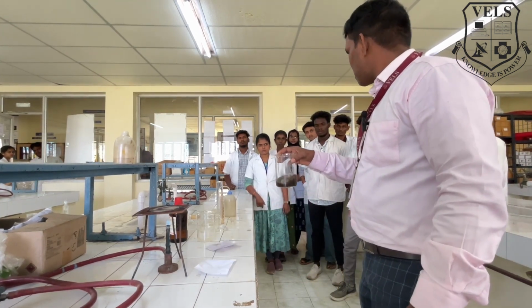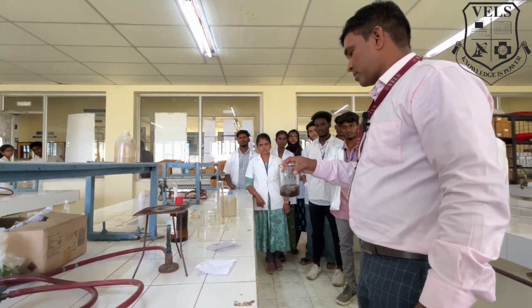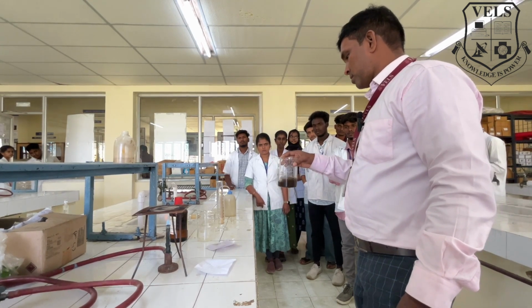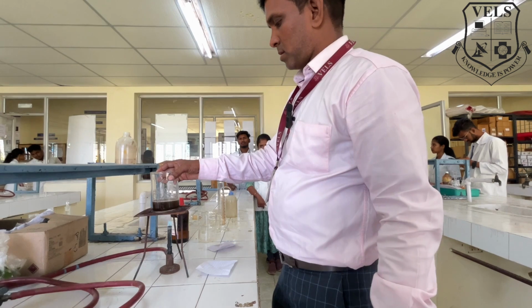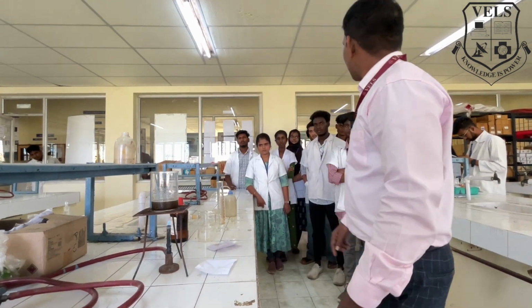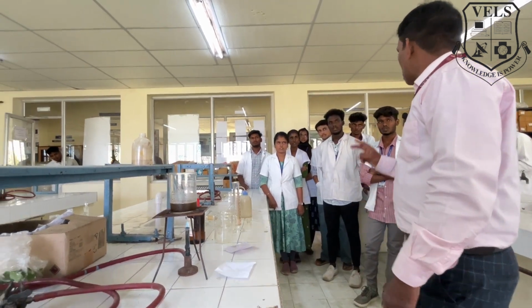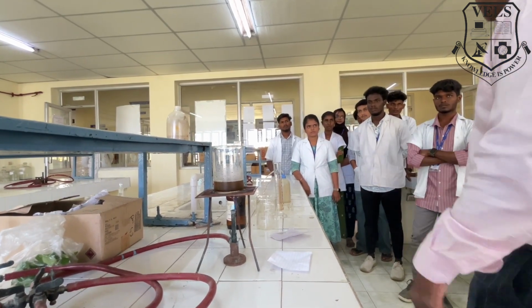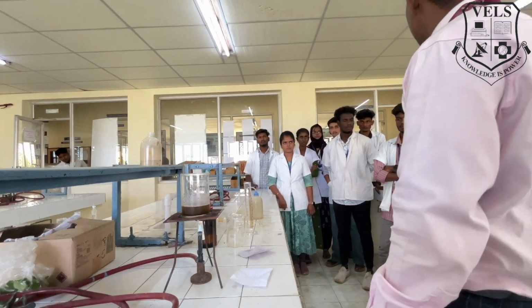Gently stir the solution. Heat the solution for 2 hours. Kindly add the porcelain bits.